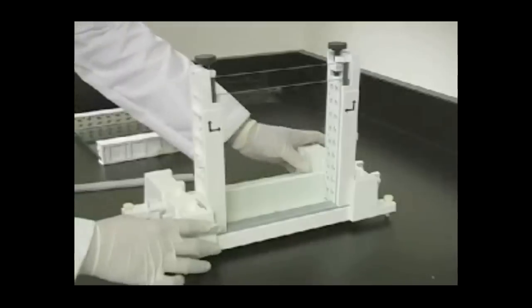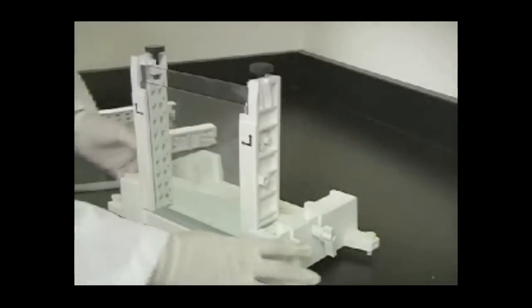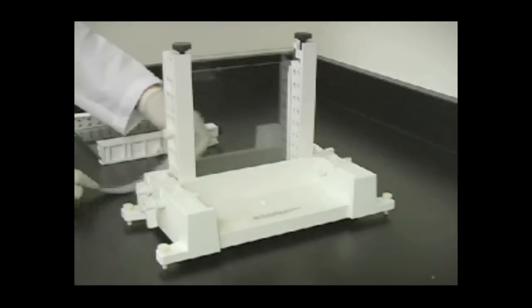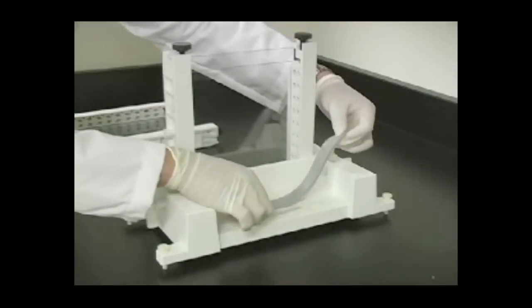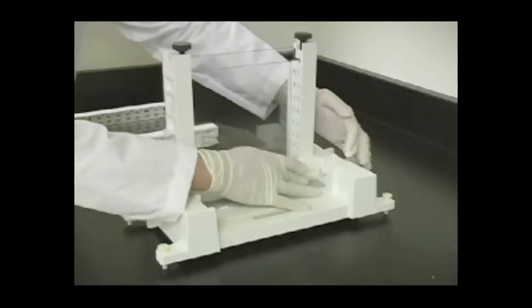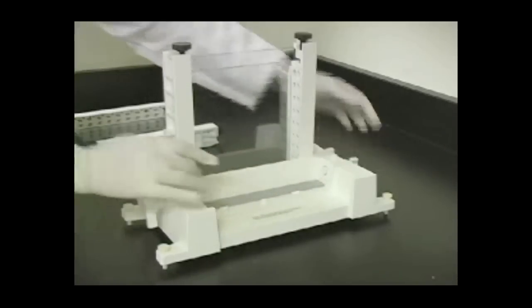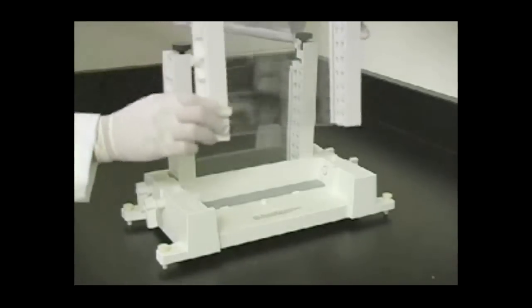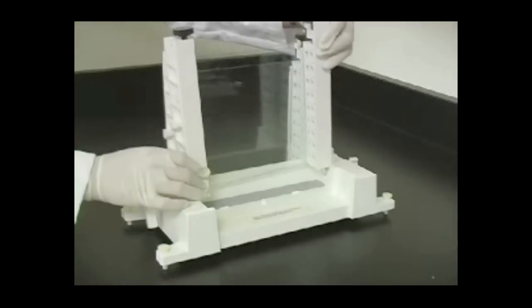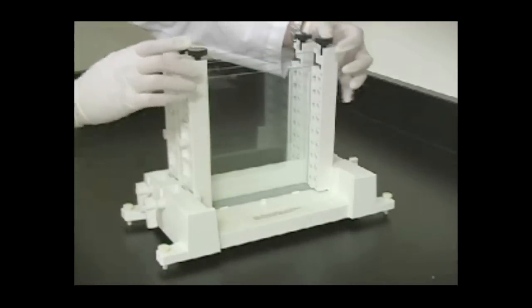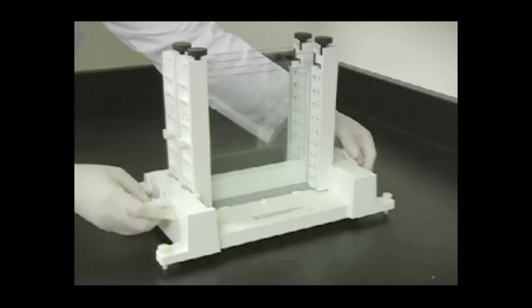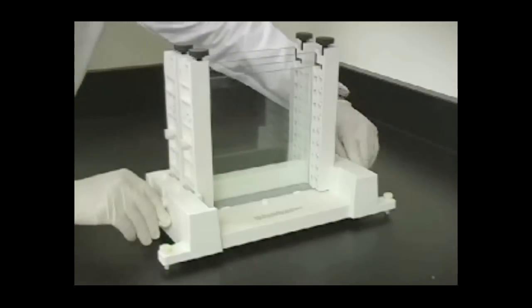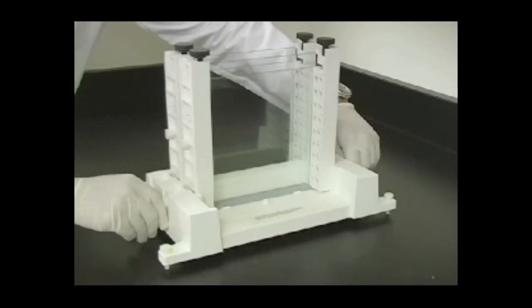Repeat the assembly of another glass plate sandwich. Place the assembled sandwich in the remaining slot in the casting stand so that the short plate is facing outward. Tighten the cams like before. The sandwiches are now ready for gel casting.